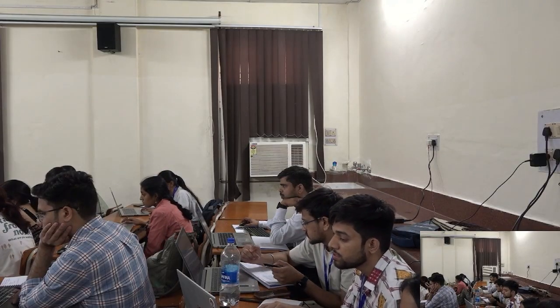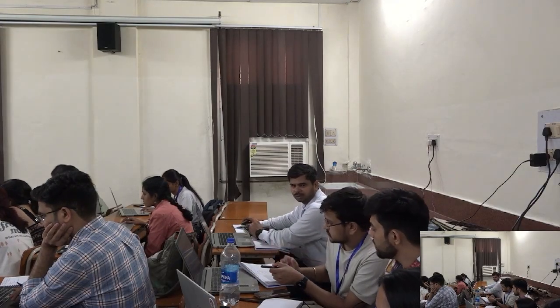Okay. How many of you could answer that question? Is it part of a protein coding gene, or are you still trying? Yes, it is part of a protein coding gene. Yes or no? Yes. Okay. Anyone still trying? So could you get the last 15? Yes, sir. Okay. And is it part of a protein coding gene?